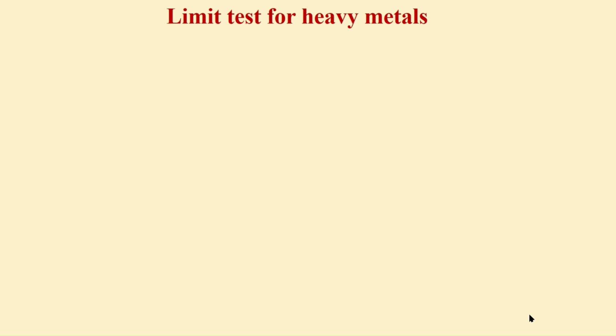Today's subject of discussion is the limit test for heavy metals. This is a test which is used to detect the presence of heavy metals and also to know whether these heavy metals are within the prescribed limits of the Indian Pharmacopoeia.